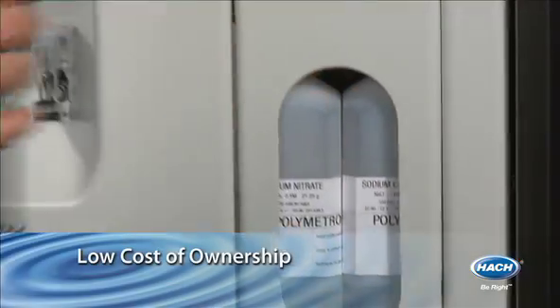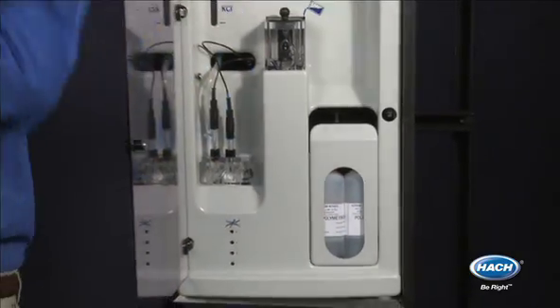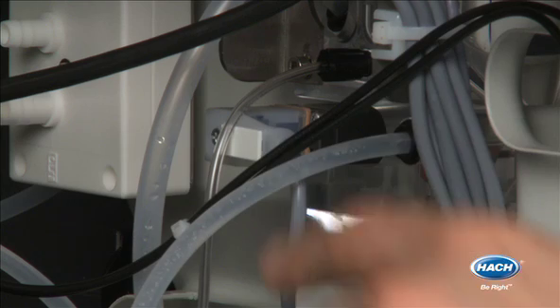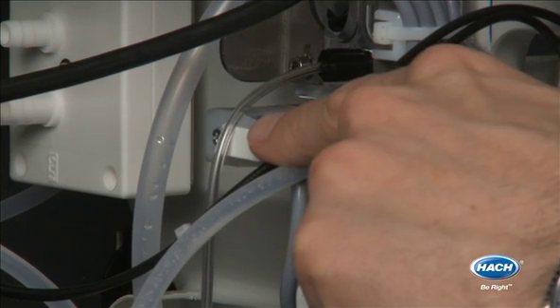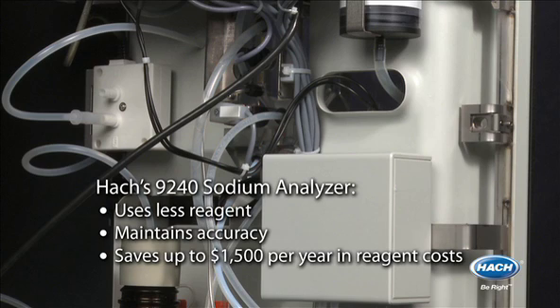Unlike other sodium analyzers, the 9240 uses just the right amount of reagent by eliminating temperature interference. The analyzer uses an online temperature sensor and a three-way valve to maintain a constant pH at different sample temperatures. Use less reagent and still maintain accuracy, saving you up to $1,500 a year in reagent costs.